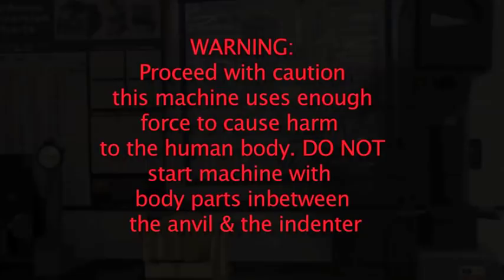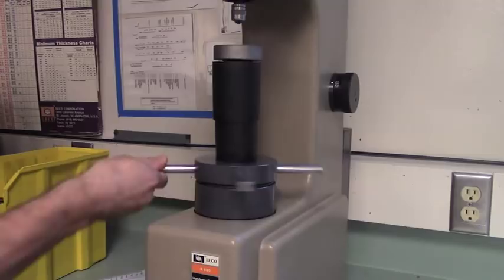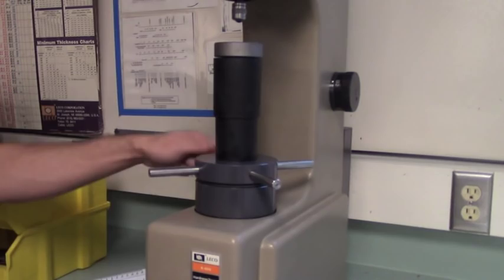Rotate the anvil adjustment clockwise in order to raise the anvil. You can also turn the anvil adjustment counterclockwise to lower the adjustment. Raise the anvil so that it is approximately 1.5 inches from the indenter height.